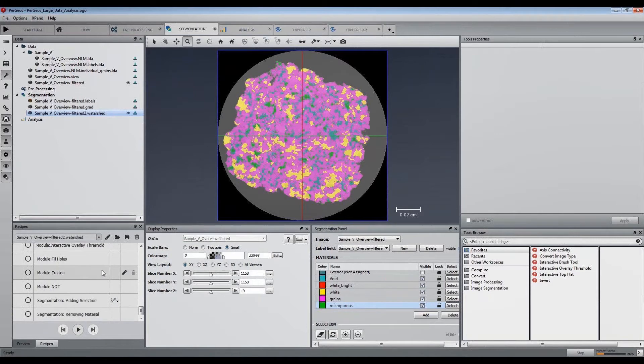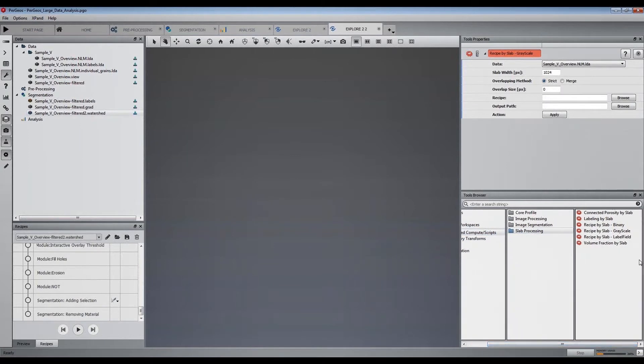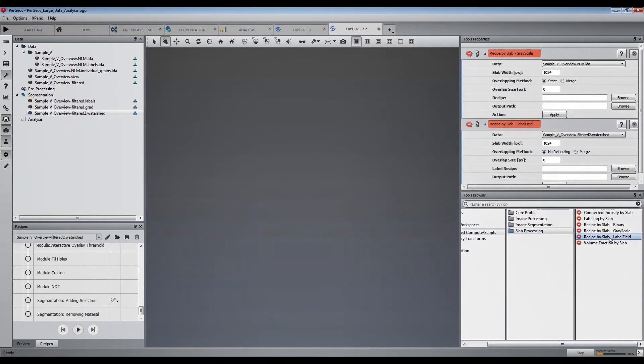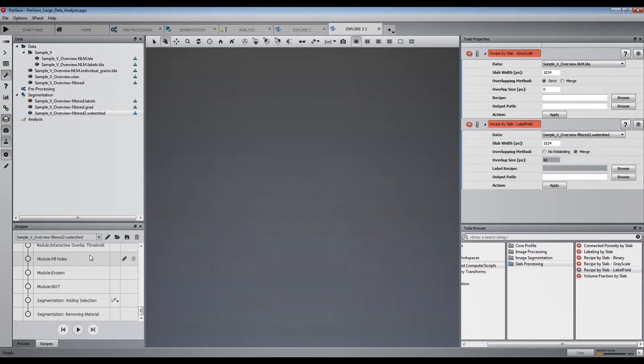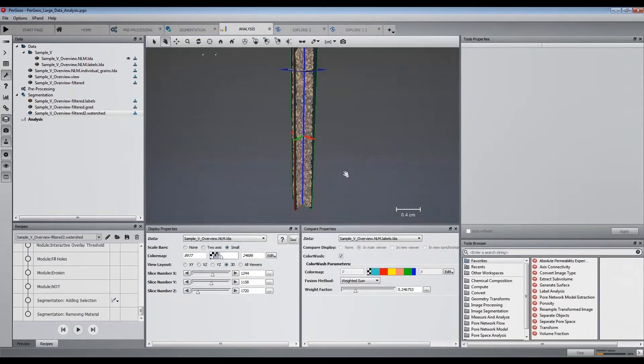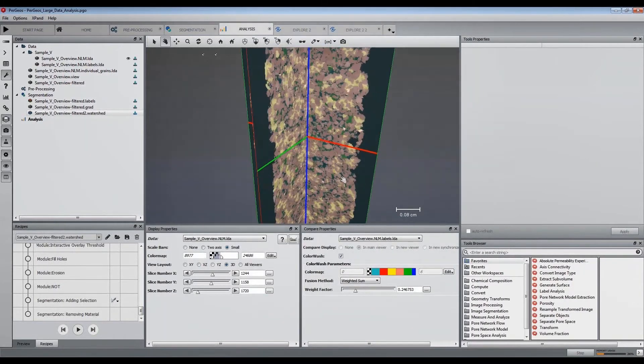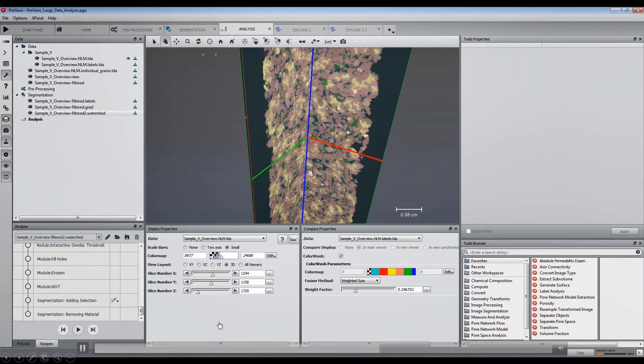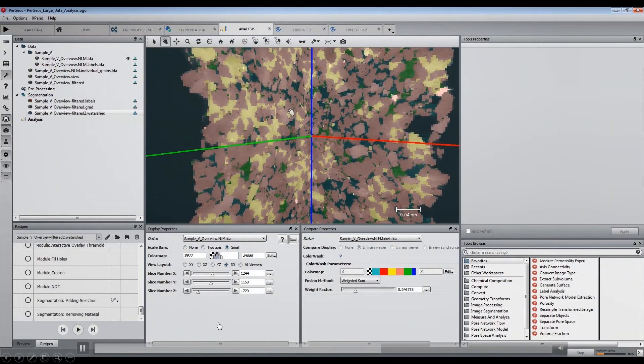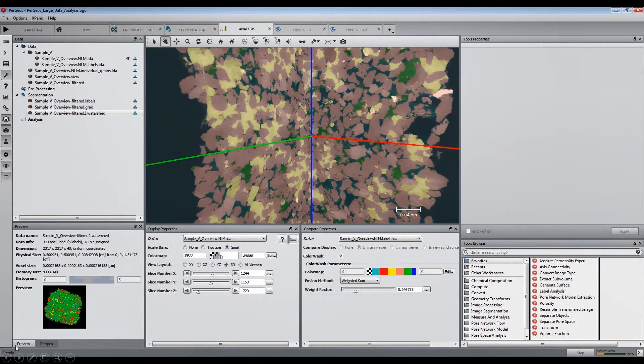Once the recipe is computed, in order to apply it on the whole volume, we again open the Explorer workspace and apply the slab processing module. As this is here based on the watershed, an overlap is needed. 50 slices is a good value for this data.